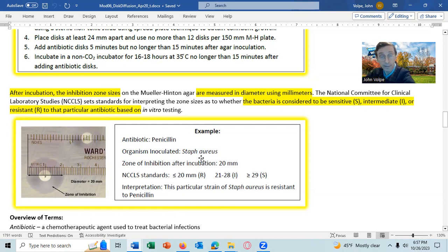So what we have for Staphylococcus aureus could differ for what the resistance is for the zone of inhibition for Staphylococcus epidermidis, and certainly would be different for E. coli, because that bacteria is very different from Staphylococcus aureus. Any question about any of that?